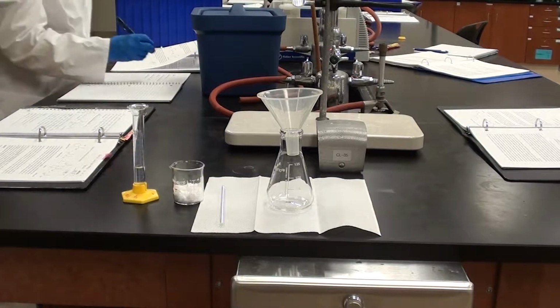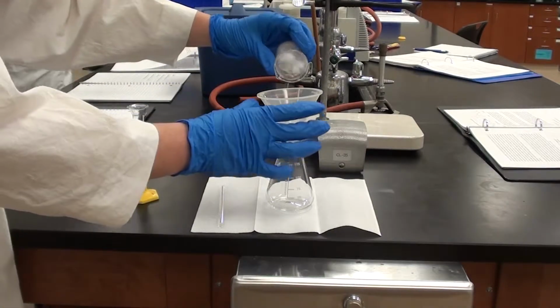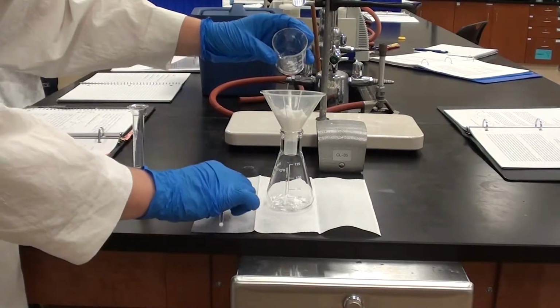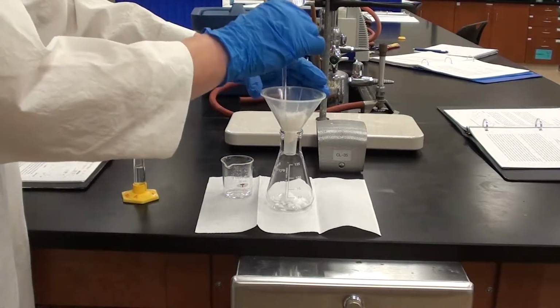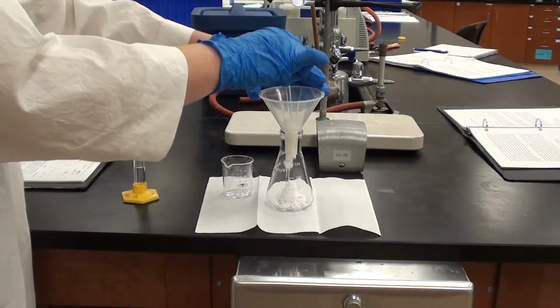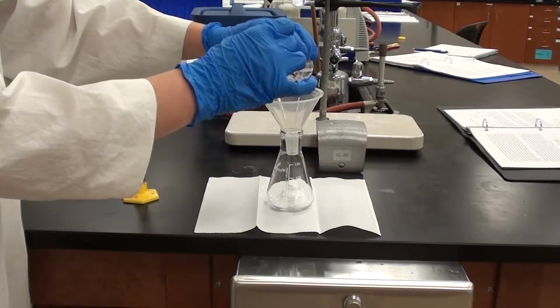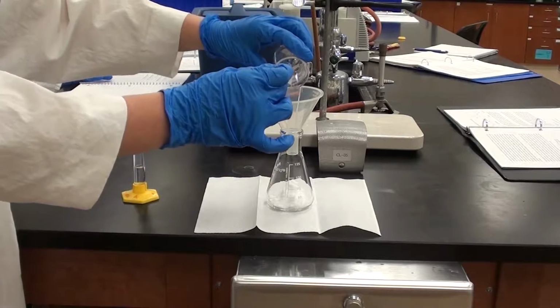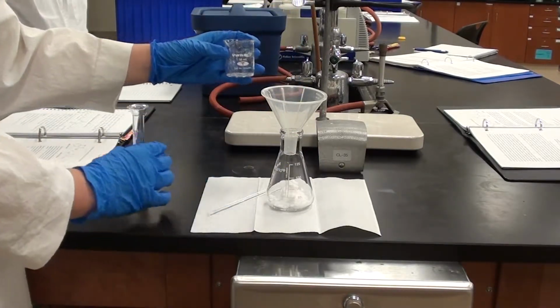We're going to go ahead and add the salicylic acid to the flask. We're using 125 here. If you use 125 or something smaller, she's just going to try and stuff that down in there, and then we can rinse in the remainder with the acetic anhydride. Should I rinse this? Yeah, you can rinse that as well if you want. Try and get as much as you can out first, and that's what you've done. It's good.